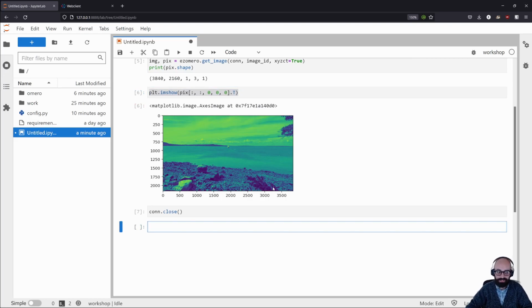Now we are going to be doing the same thing using the default OMERO Python API. And you will see that it's a little bit more involved. There's a little bit more work. The code is slightly less legible. And I should emphasize here that this is not me saying the default Python API is bad or anything like that. It is super powerful, and under the hood, EasyOMERO is just using the default Python API. So it is excellent stuff. It's just kind of difficult to use if you're starting out. So that's essentially the niche we're trying to fill in here.